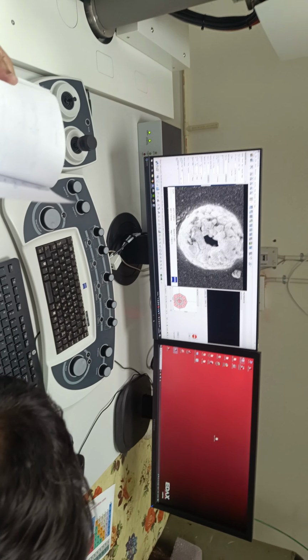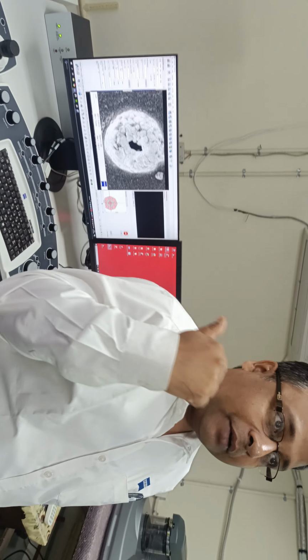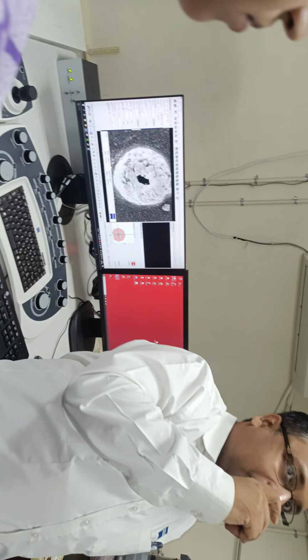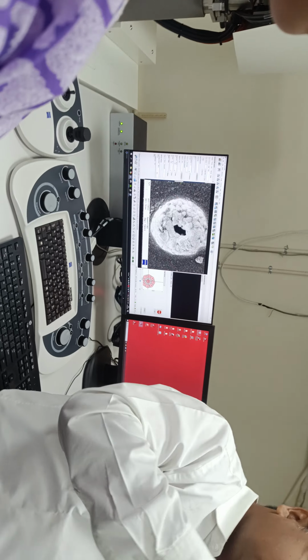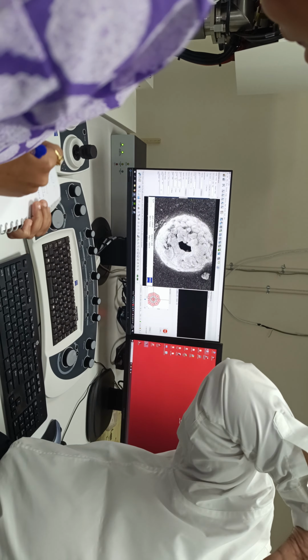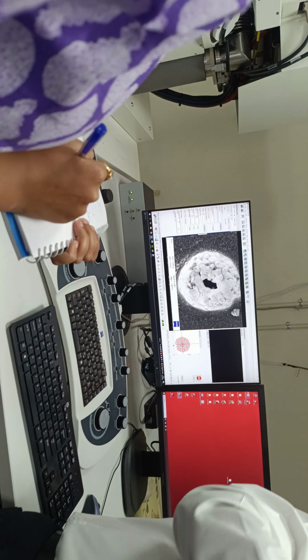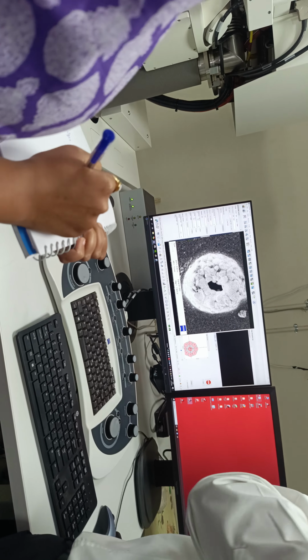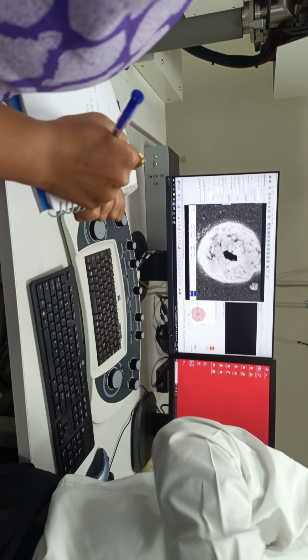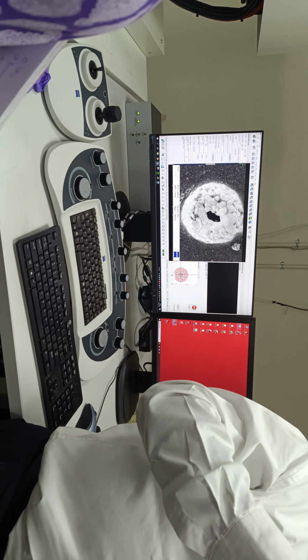So let me tell you, this is the interesting thing. Astigmatism occurs due to imperfection in the electromagnetic coils. These are nothing but the electromagnetic coils, right? Since the electron wave is an electromagnetic charged particle, it has to be controlled by electromagnetic coils. There are imperfections in the electromagnetic coils, and that is why the astigmatism error occurs.